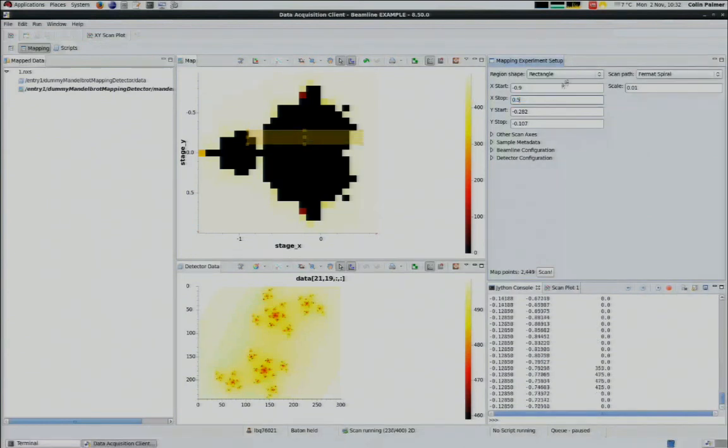We've got full data binding, so I'm dragging on there, and you can see the updated fields on here. There'll be another example of that later. I can also type values in here, and it updates on the plot. I can change the different types, so I can draw a line on. You see the fields all update nicely.